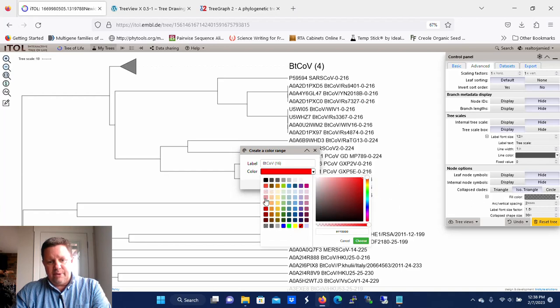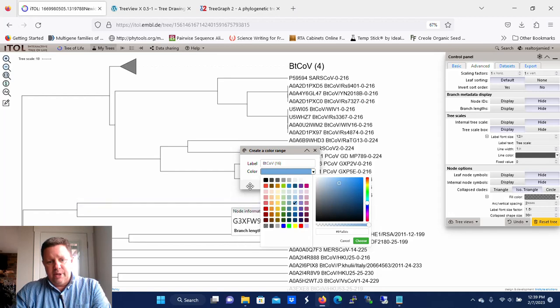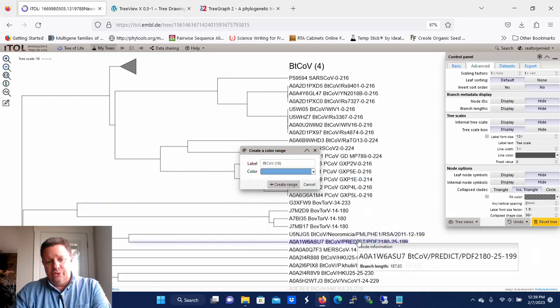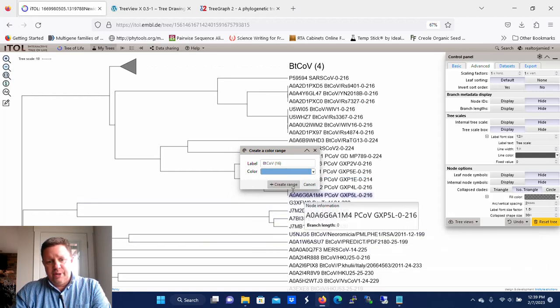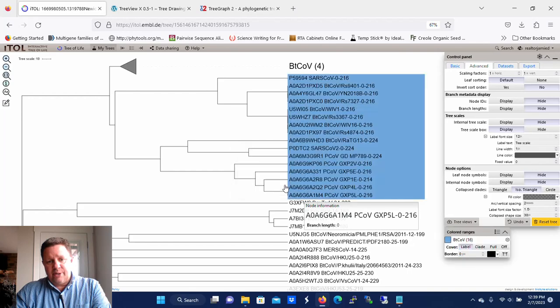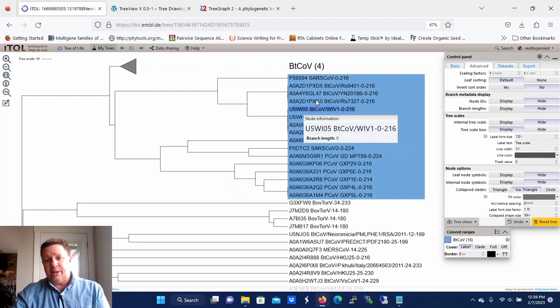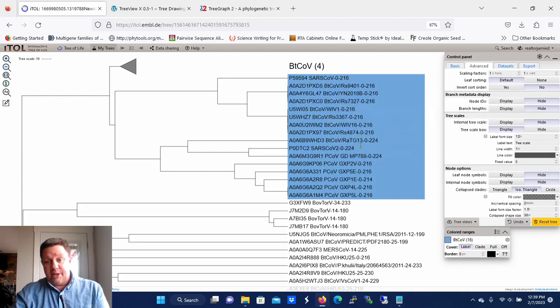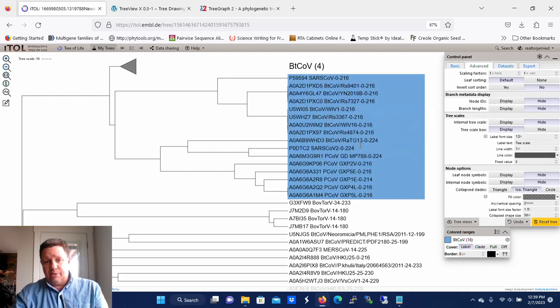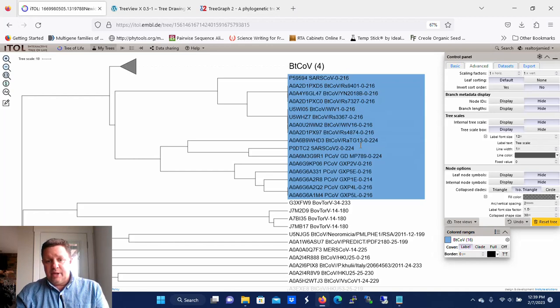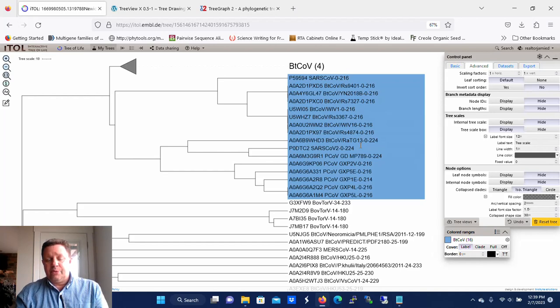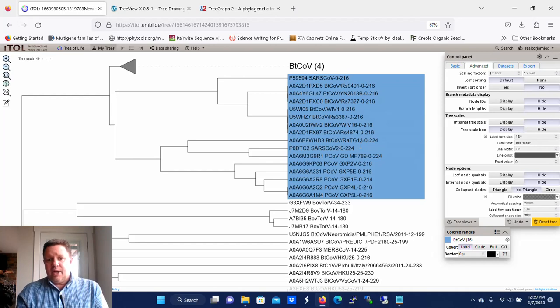We're going to click Create Range, and when we do, you see that that entire clade gets highlighted. So now you would provide a key in whatever publication that you put this in, and that key would indicate that the blue box represents some beta coronaviruses, however you want to classify them.